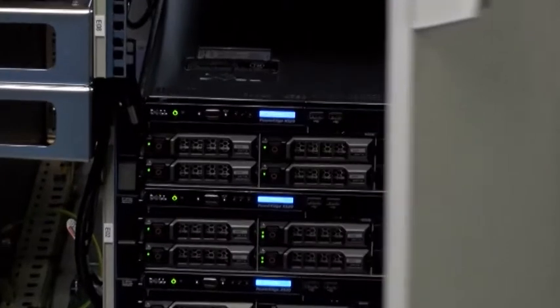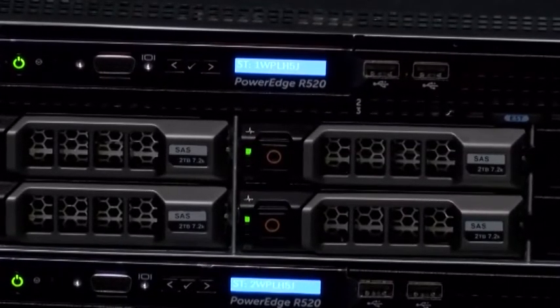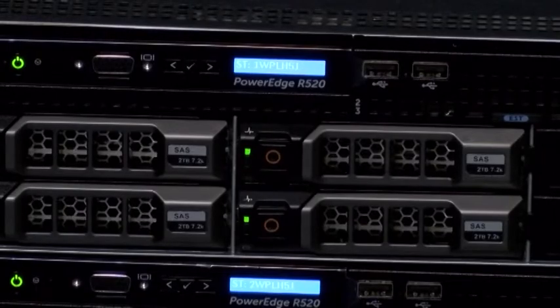In the cabinet behind me there are 6 rather large servers. We have the main system on a very powerful Dell server. The synTQ server is on there, and that is connected to 3 high-speed, we call them PAT machines. They're in charge of the data collection from 3 very high-speed NIR spectrometers.